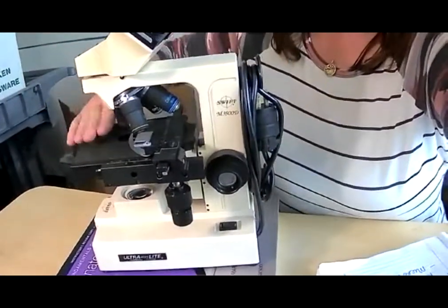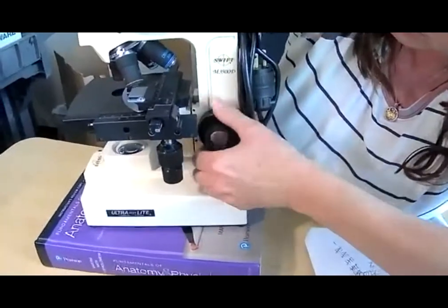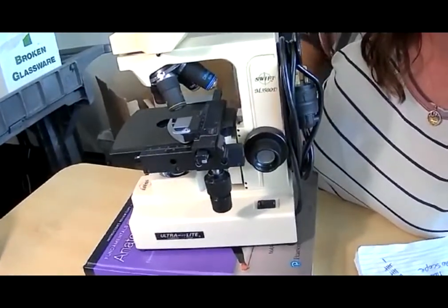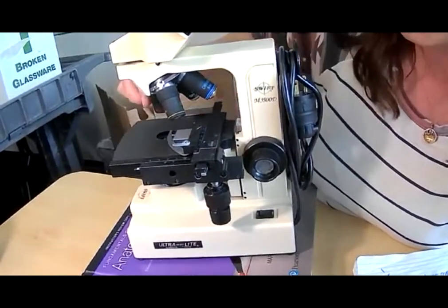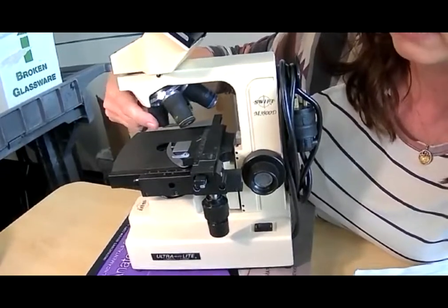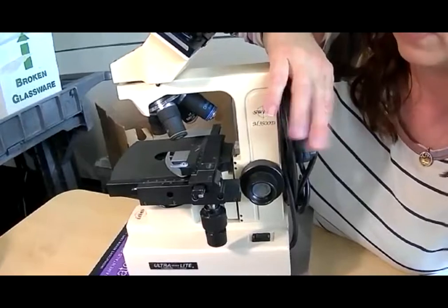So this is our stage right here, and you want to lower this stage all the way down. You're going to lower this stage all the way down. It's going down. So when you put it up, you want to make sure this stage is all the way down. You also want to make sure that the smallest objective, called the scanning objective, which has a red print right here, goes down. So scanning objective down, stage all the way down, and cord all the way wrapped.